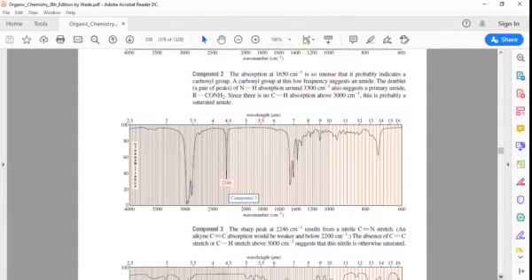Okay, very interesting. At first glance, we notice this. Whenever we notice this, it is a carbon-nitrogen triple bond, and so this compound is most probably a nitrile. So this is your 3000, and no carbon-carbon double bond is indicated because we don't have any sp2 hybridized carbon-hydrogen stretching.